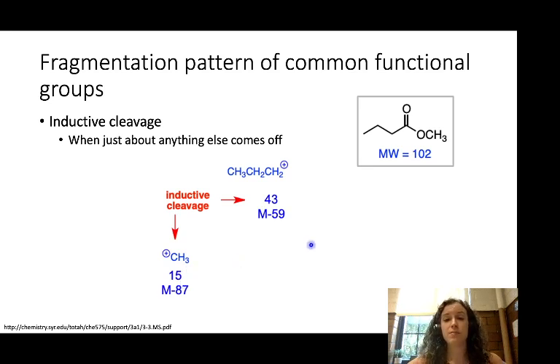And so folks, keep all of these things in mind when you're looking through the mass spectra. Keep in mind the parent ion and try to get comfortable thinking of groups that might break off. What's the mass of an OH? What's the mass of a CH3? Some of the things that we'll have to work on together for the rest of the semester. And this wraps up the video about mass spec.